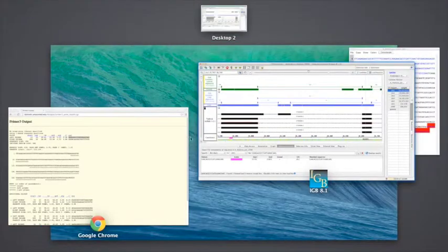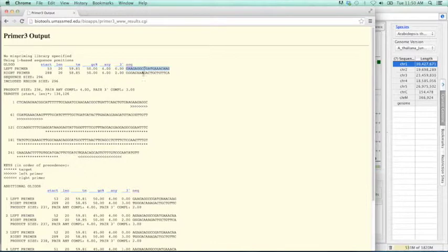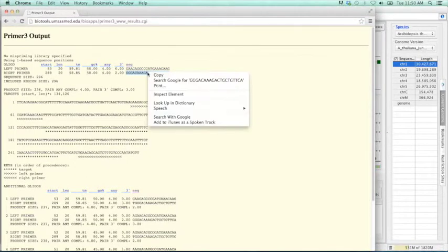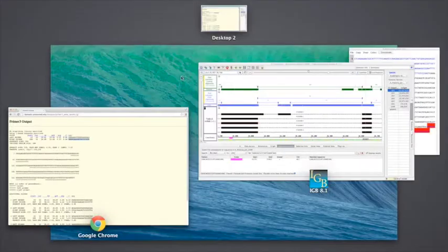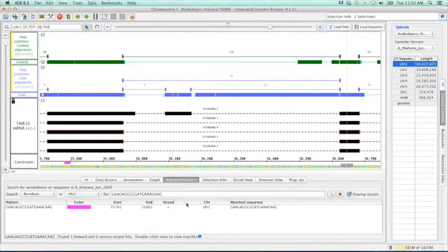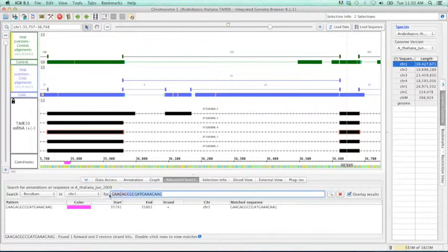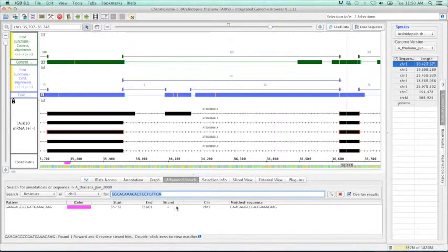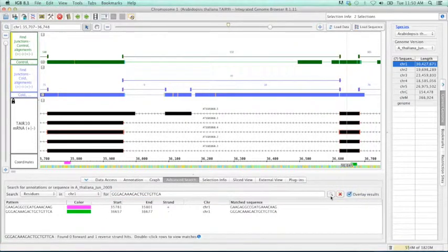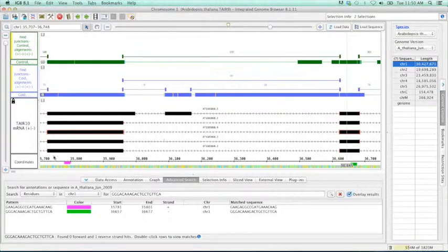So let's jump back and grab our other primer. Copy. And search.